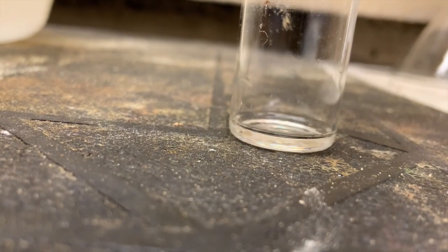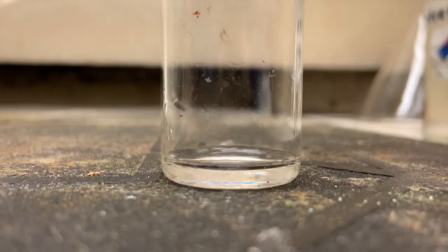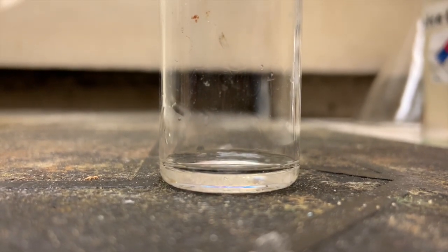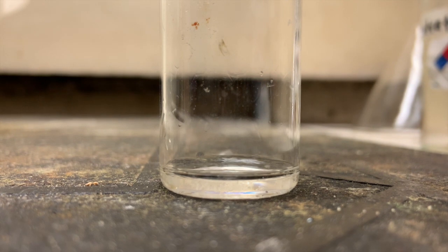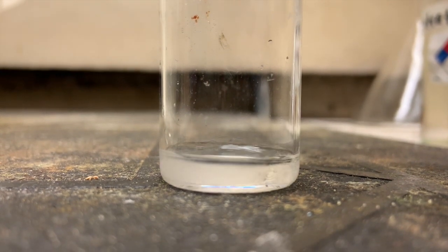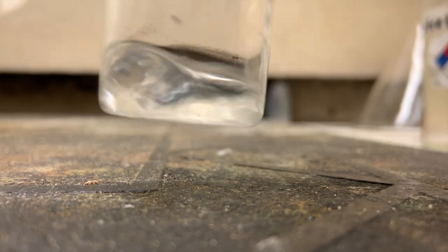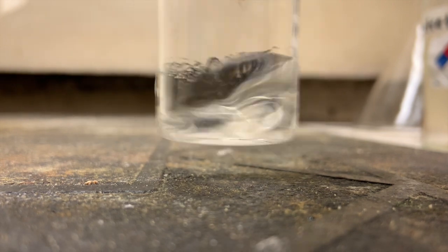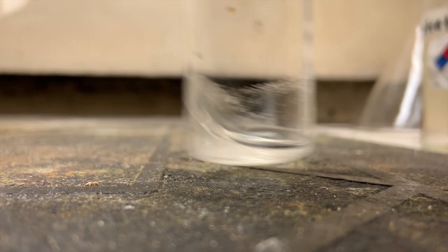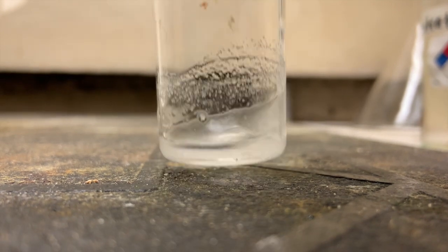Okay, I'm all done with my water bath, and we can see that my solution is no longer cloudy, so all of the salicylic acid has dissolved. I'm going to add 0.5 milliliter of water to get rid of any excess acetic anhydride. So I'm going to shake it around, and I'm in the fume hood because if there's any acetic anhydride still present, I don't want to be doing that outside of the hood.